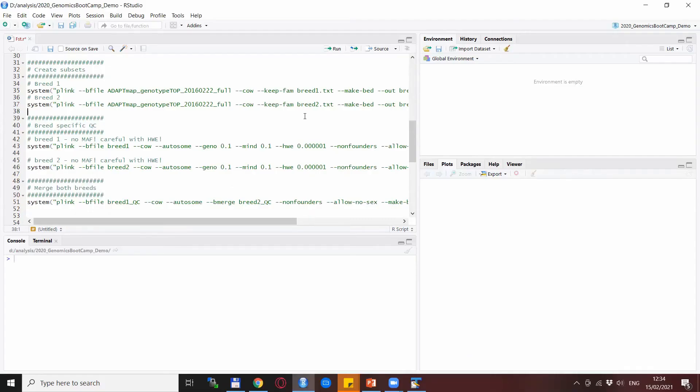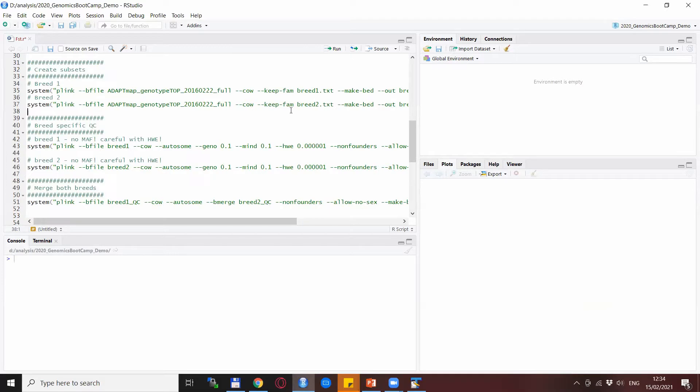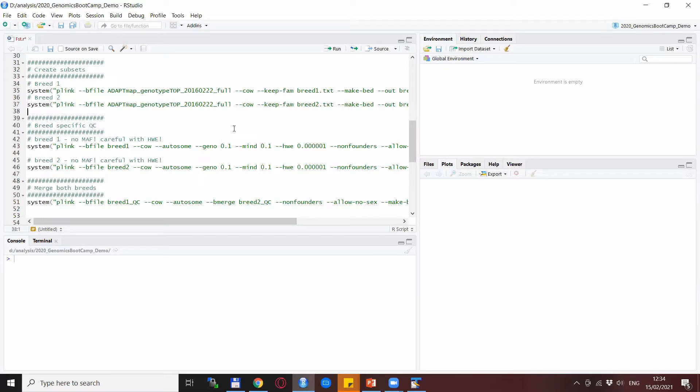We will continue with the quality control, and here I would underline that the quality control must be done for the two breeds separately and also that we should not use MAF and we will be very careful with Hardy-Weinberg. We definitely should not do the quality control for the two breeds together.